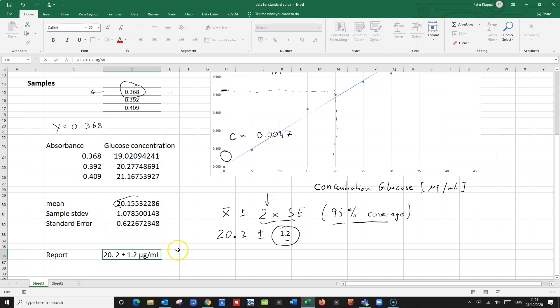So that would be the correct way to report the concentration of our unknown samples as 20.2 plus or minus 1.2 microgram per milliliter. That would be the equivalent of the glucose in our honey experiment. Of course, if we had diluted the honey in the first place, we would need to take that into consideration and multiply this value by our dilution factor. I hope this makes sense, and thank you very much for watching.